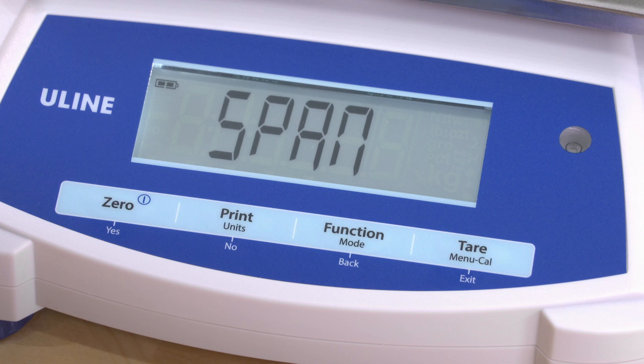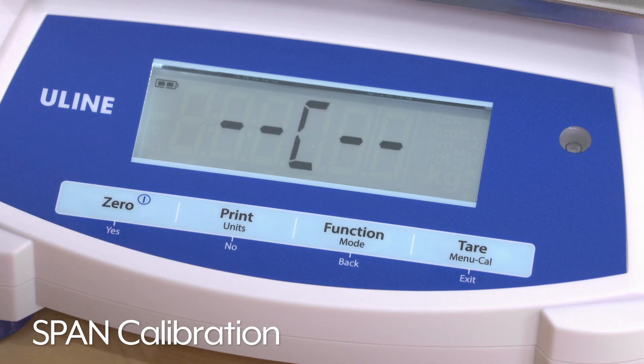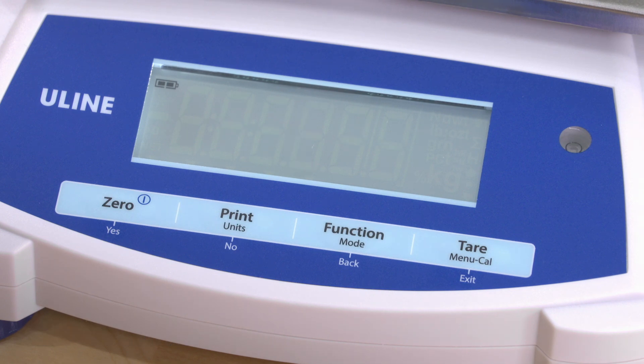Then, Span will be shown. Press 0 again to begin the span calibration. C will blink while the 0 reading is stored.